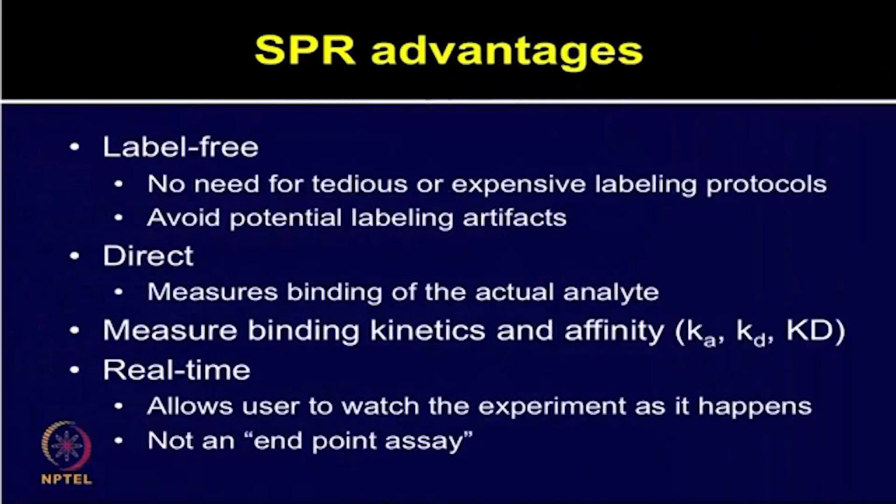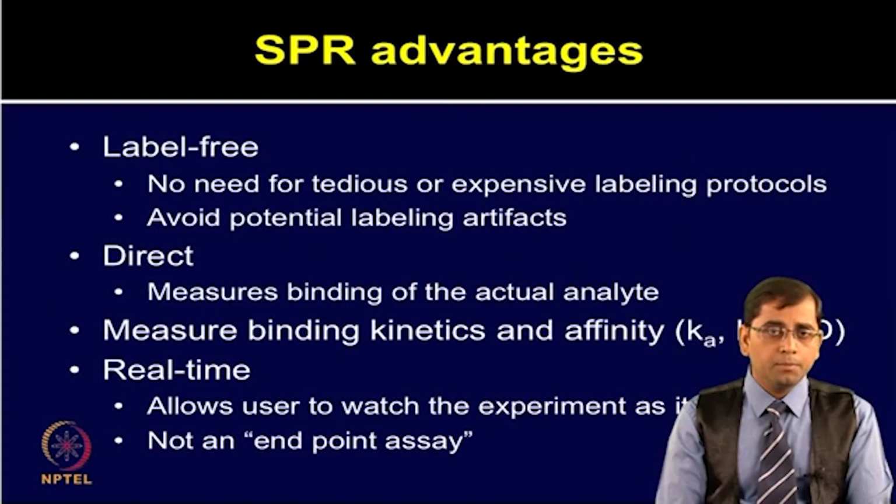There are many advantages of using SPR. First of all, it is a label free method, so there is no need of addition of tags by following tedious labeling methods.